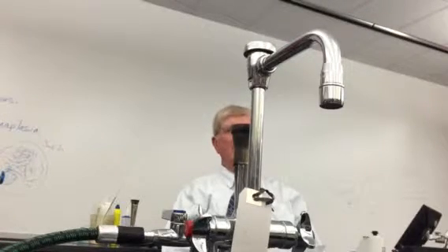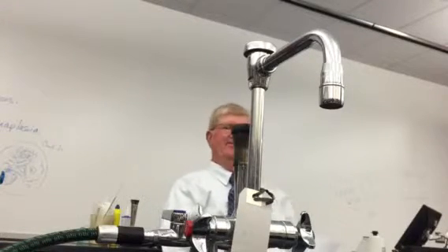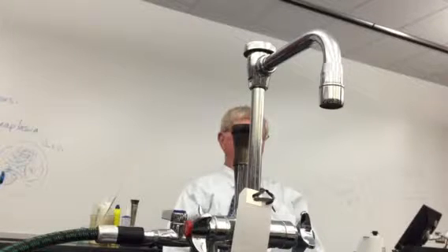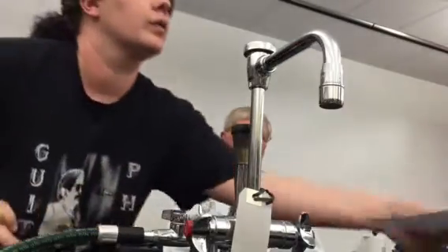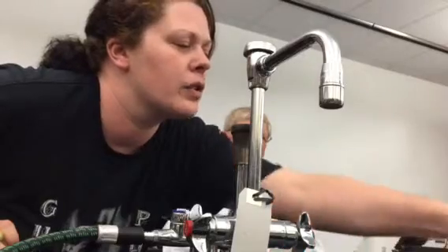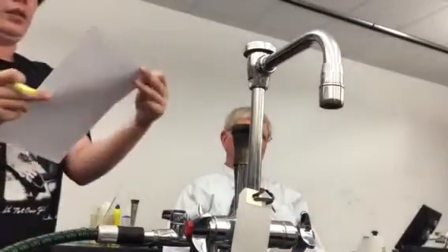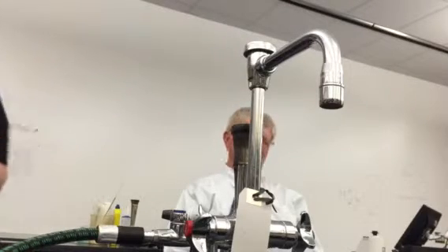What biochemical reaction, which column do you need to look in? The biochem reaction part. Fermentation. Where do you see fermentation? That's the second week. You're in the wrong week. I showed you to look under the biochemical reaction, and you said, uh-huh. It is right for week 2.